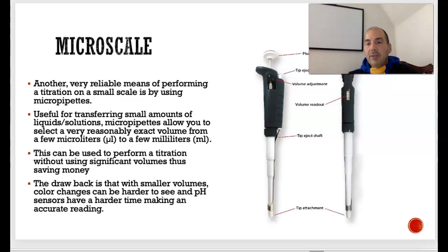Okay. I said there was a more accurate device, and those of you in research in molecular genetics are used to these micropipettes. It is a very, very efficient way of measuring small volumes, even way more efficient than the burette, and burettes are very efficient. So if we're doing a lab on a micro scale where we don't want to make liters of solution, we only want to make a few milliliters of solution, doing a titration with micropipettes will make it much more efficient in that way.